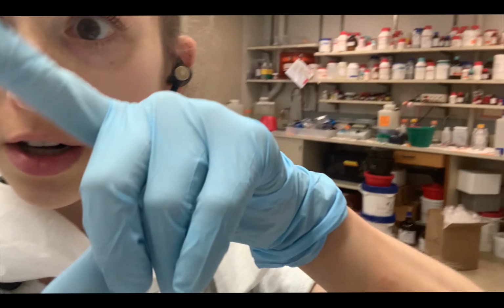Fluorescence is when a molecule absorbs energy of one wavelength and lets off light of a different wavelength. So it absorbs the energy given off by the radiation and gives off light, and the scintillation counter can multiply and detect that. It's super sensitive, and it gives you these numbers.